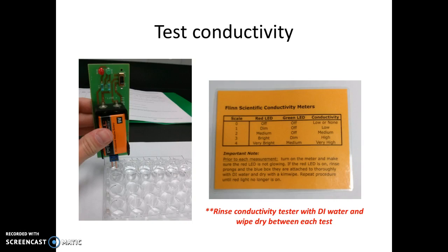It's important that you rinse the electrodes between each test. As you go from one solution to the next, rinse the electrodes with deionized water and wipe them off with a paper towel. This is important to prevent contamination during your conductivity testing.